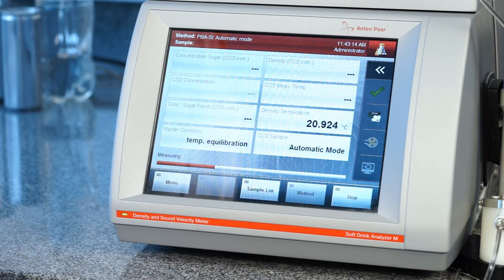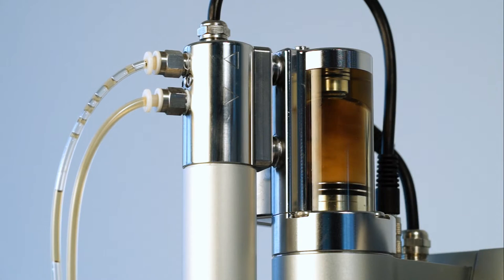As soon as the automatic filling procedure is completed, the PBA system will start the measurement sequence of all devices. The CARBO-QC-ME performs the multiple volume expansion to measure the real dissolved CO2 content without being influenced by the presence of nitrogen or oxygen in the filled sample.